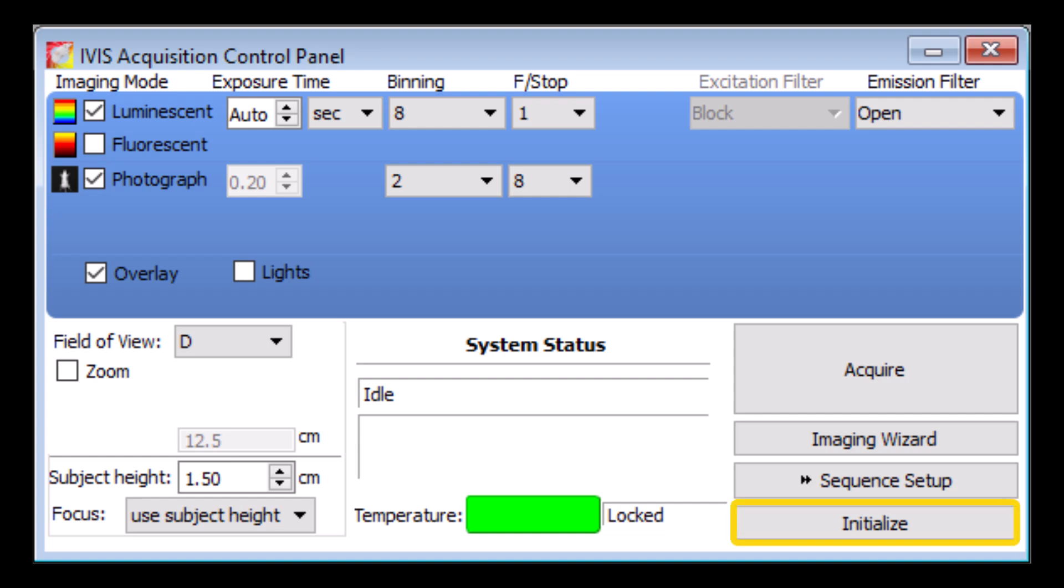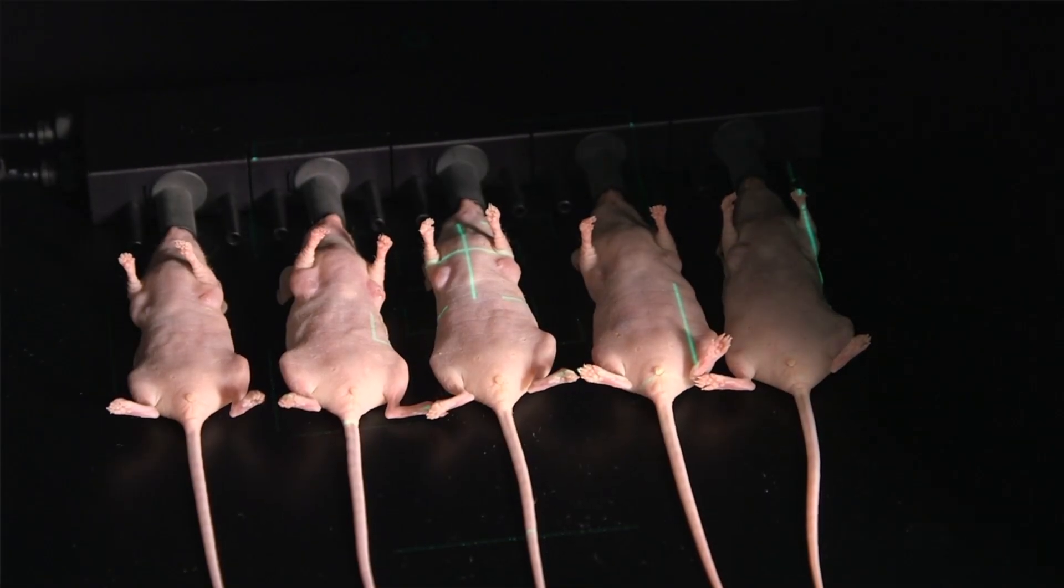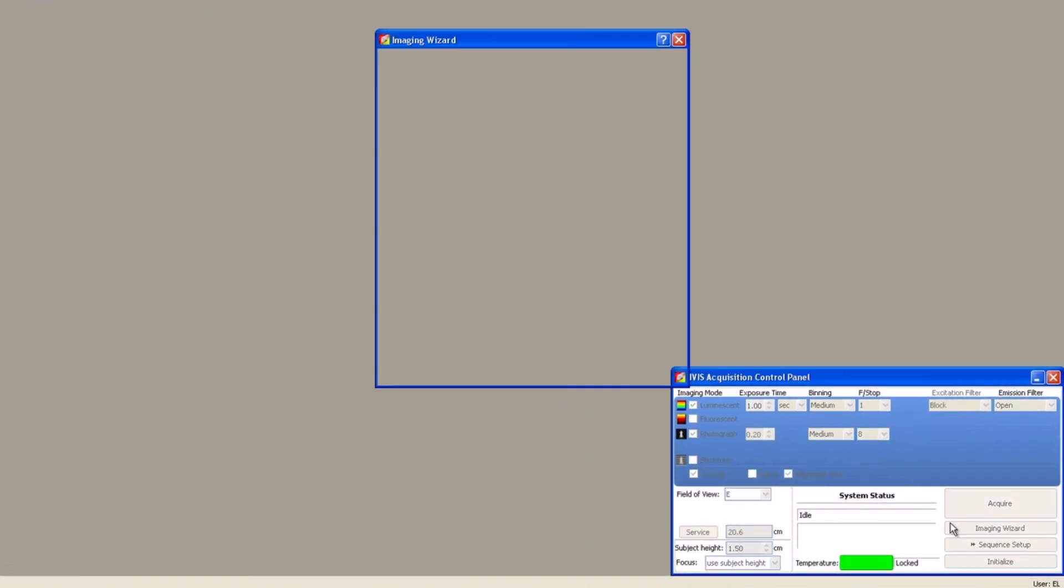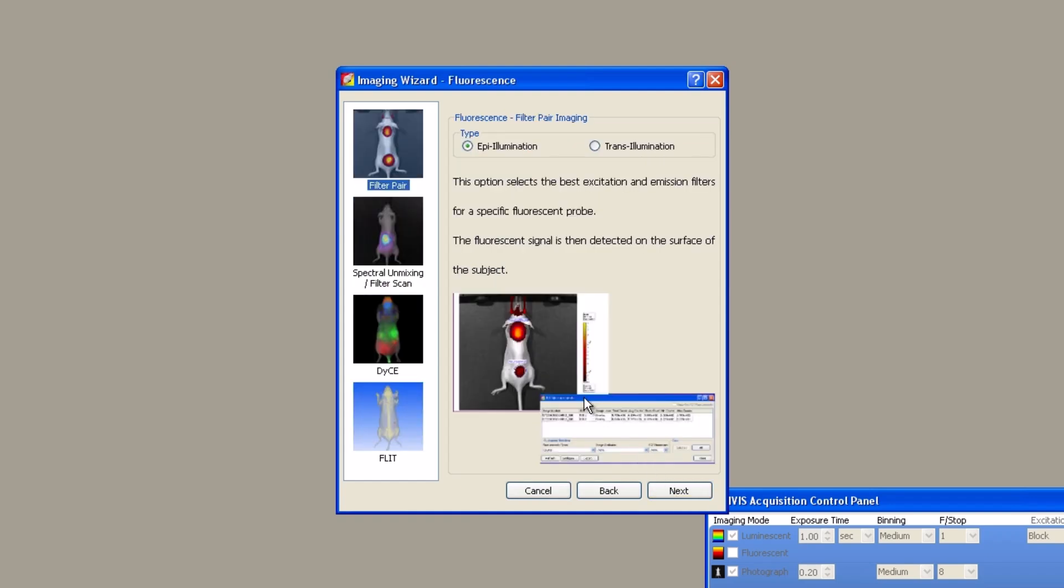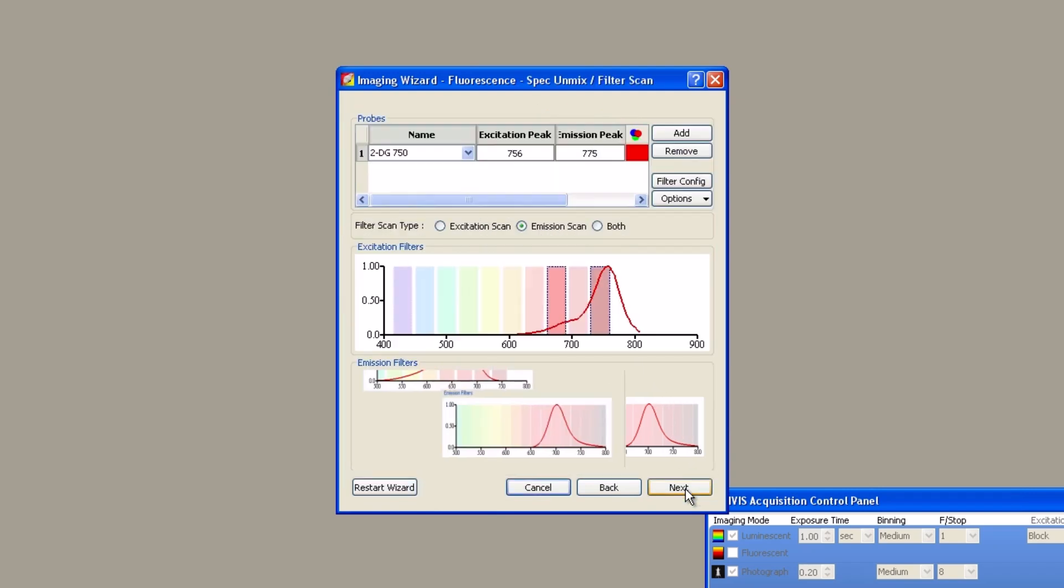We will inject these agents into our mice intravenously through the tail vein and image fluorescent activity at 24 hours post injection following the recommendations in the probe data sheets. After instrument initialization, anesthetize all five animals and transfer them to the heated stage in the IVIS. Select the imaging wizard in the control panel, choose fluorescence, spectral unmixing, epi illumination, and then click next.